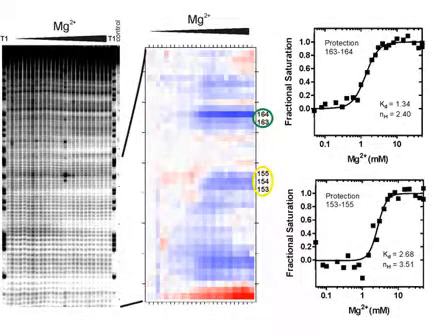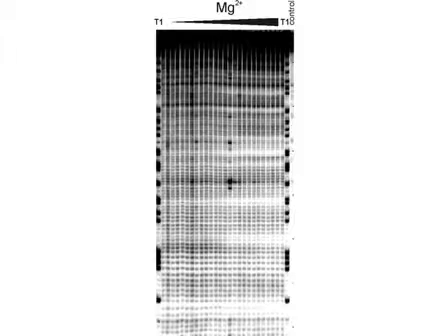Shown here are representative results from P4-P6 RNA hydroxyl radical footprinting experiments. Isotherms were derived from sequencing gels, analyzed by SAFA, and then fit as described in the analysis section. The gel image indicates that background cleavage is minimal, and that single nucleotide assignment is possible due to well-defined bands in the T1 lane. The hydroxyl radical-induced fragmentation of RNA is well above background. The transition from low to high magnesium ions is selectively affiliated with decreasing intensity of individual and groups of bands indicating formation of RNA tertiary structure.